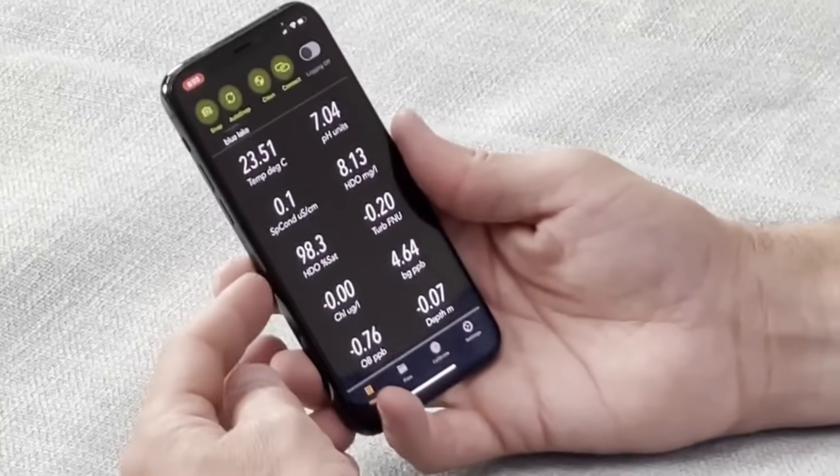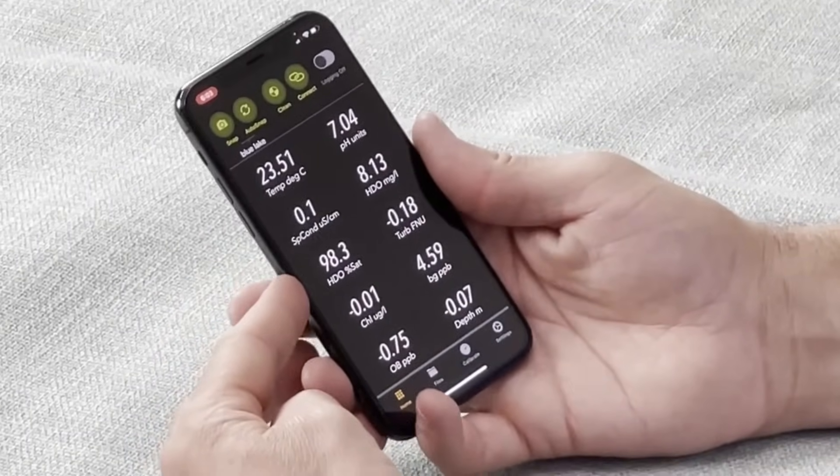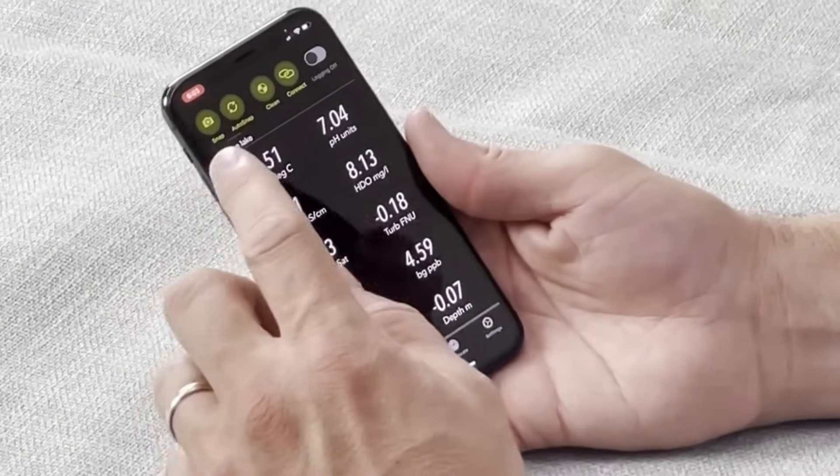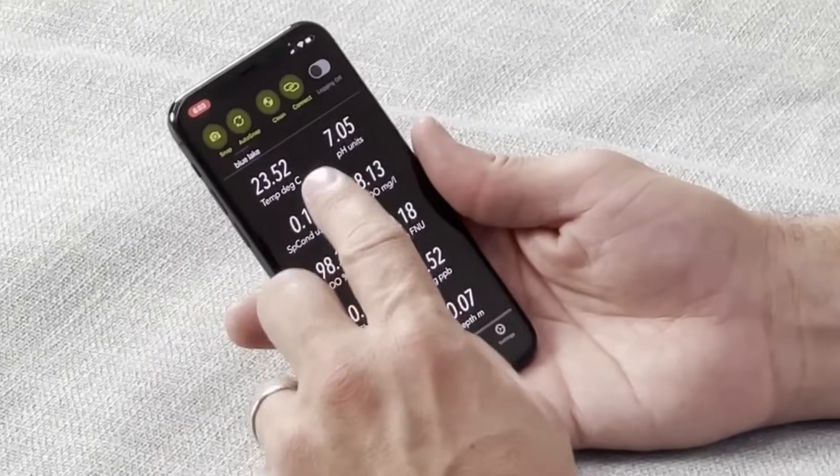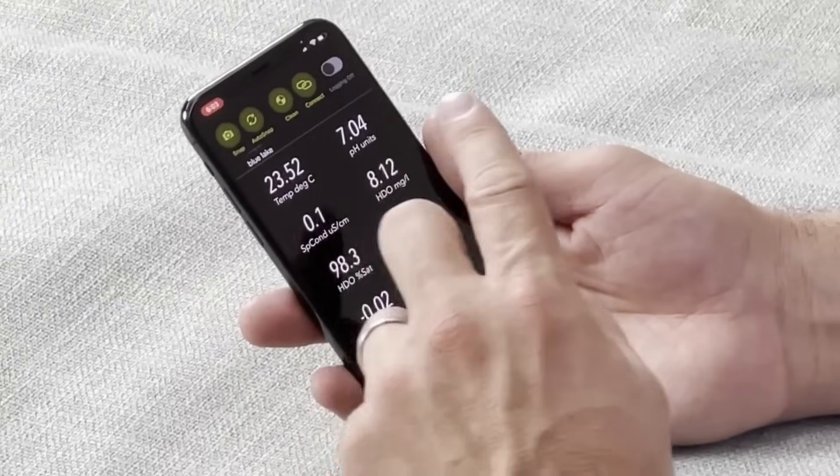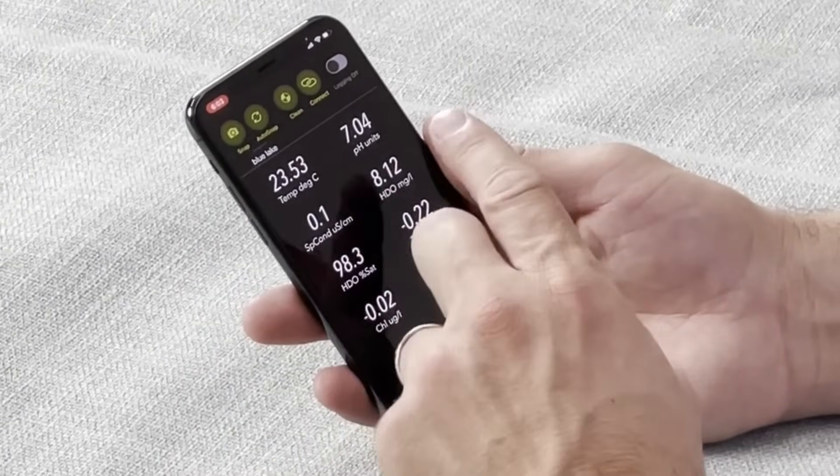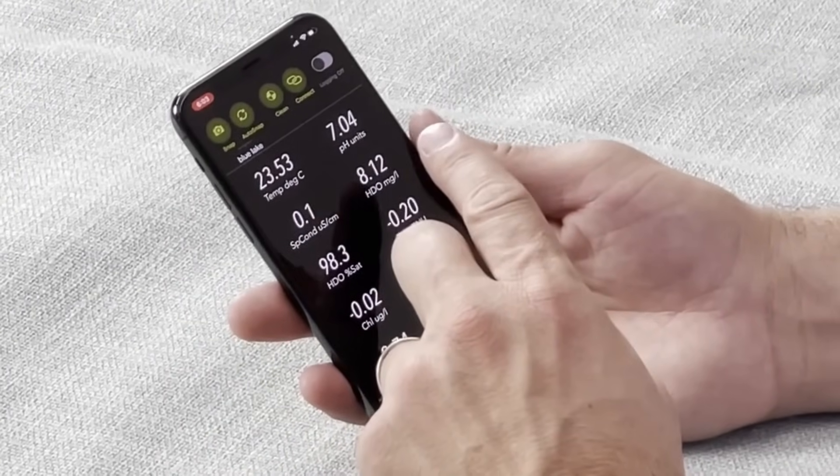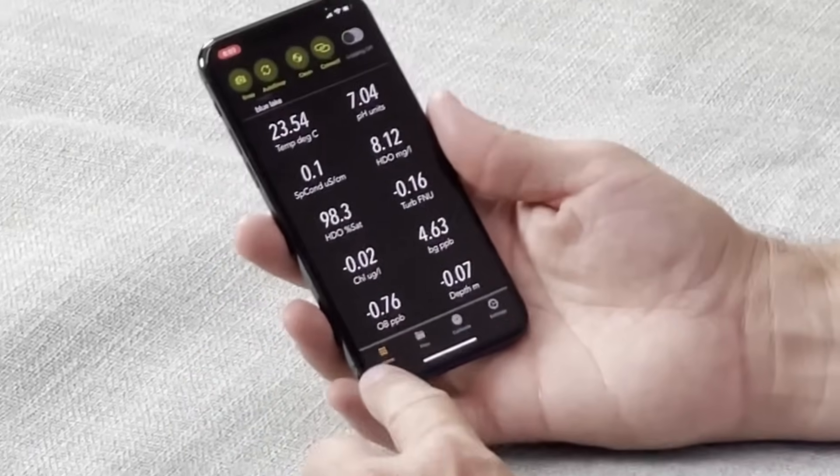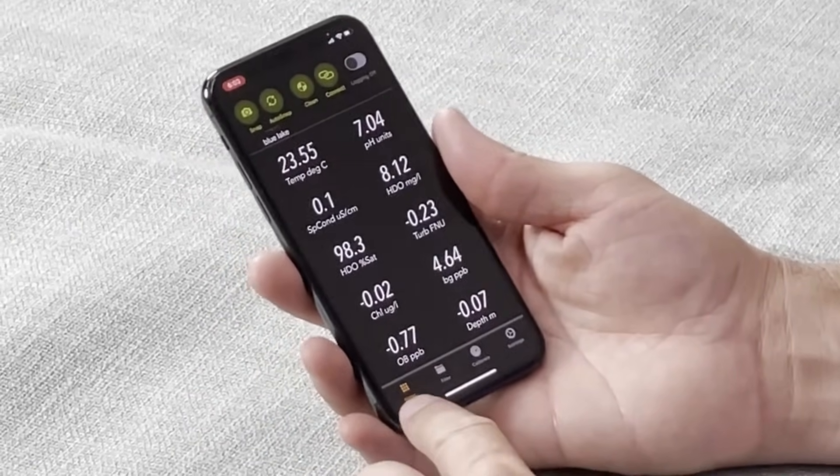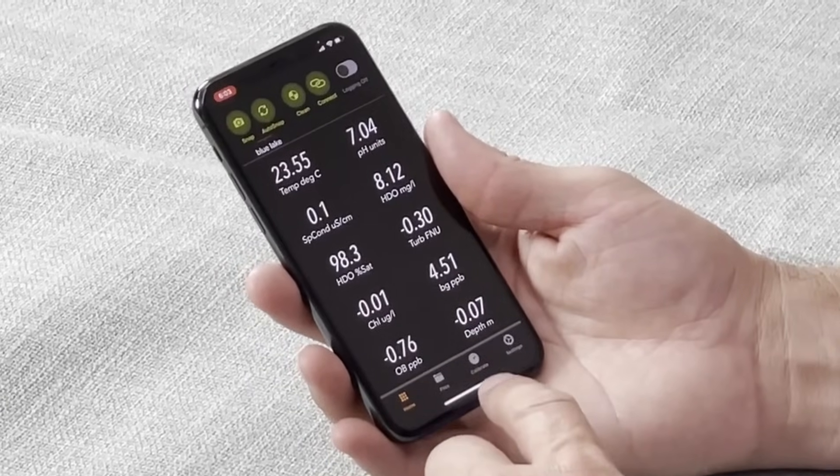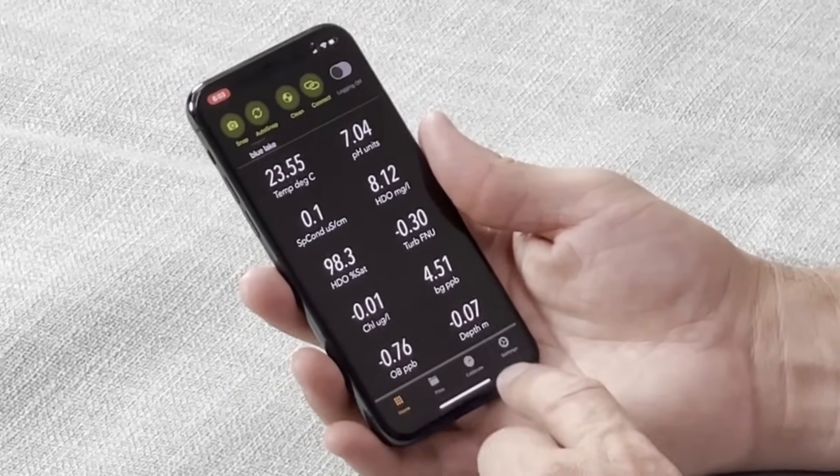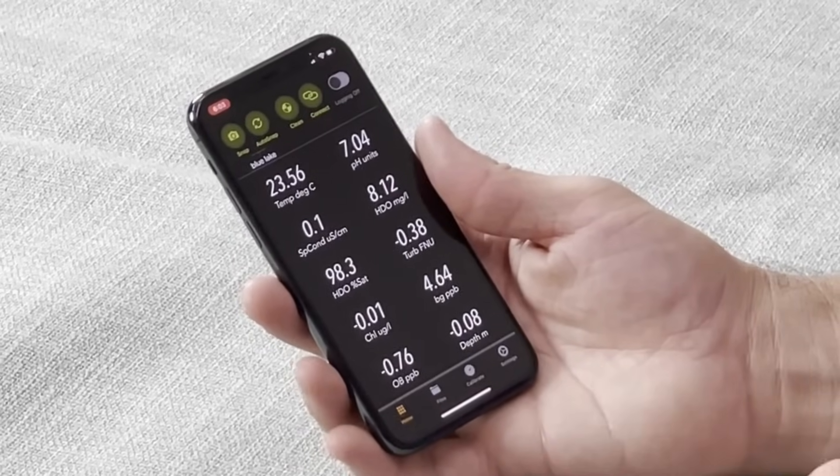At the top of your screen you have hot buttons for snapshot, autosnap, clean, connect, and logging on or off. At the bottom of the home screen you have the menu buttons: home, which is where we are, files, calibrate, and settings.